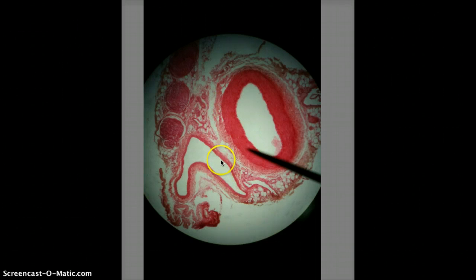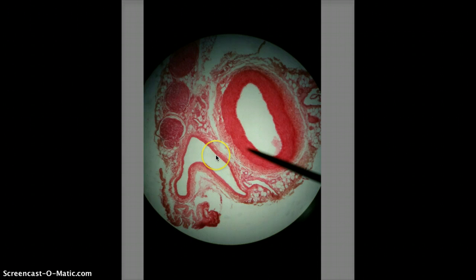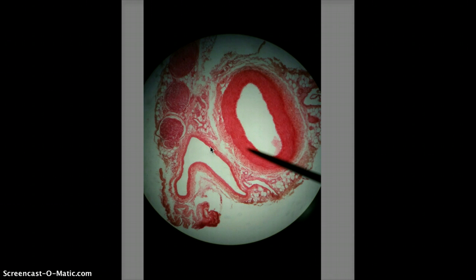Same with the vein. The tunica intima is going to contain simple squamous epithelium or endothelium. The tunica media is going to contain smooth muscle tissue. And the tunica externa is going to contain connective tissue or areolar tissue.